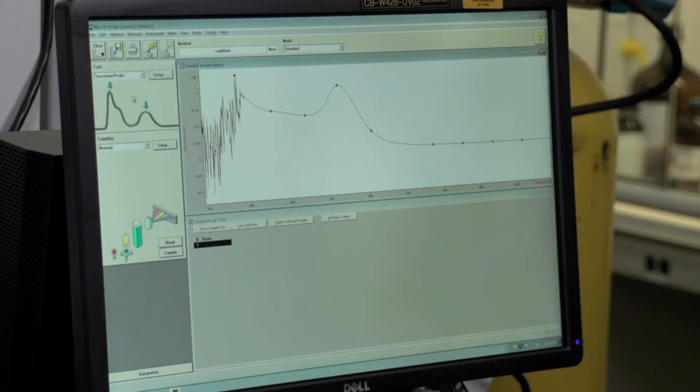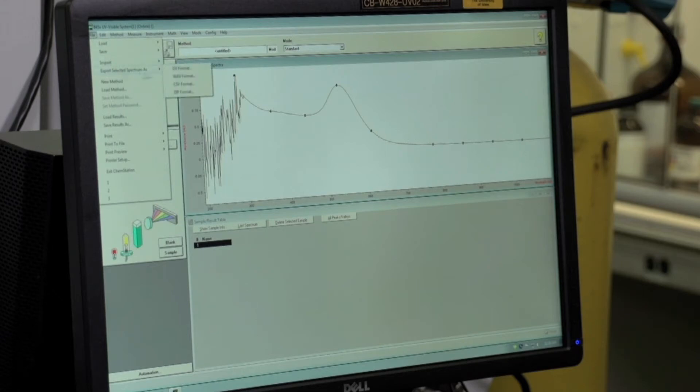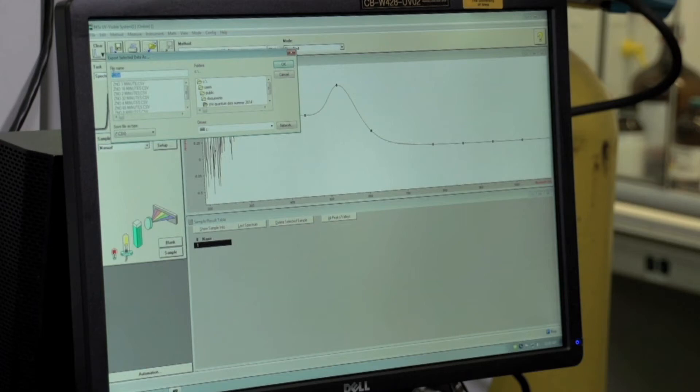You'll also want to export this as a CSV file so that you can use it in the computer lab downstairs on Origins or Microsoft Excel. So to do that, make sure your spectrum is still highlighted. Go to file, export selected spectrum as, and then select CSV file. And then name it something that you can recognize and save it in your H drive so that you can access it on any of the on-campus computers.